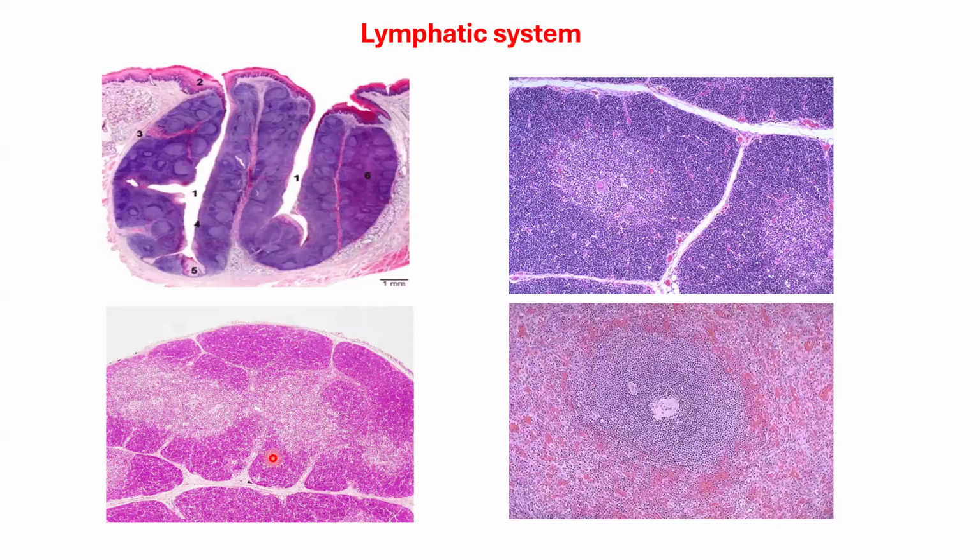What about this? For this, it's actually a higher magnification of the same. I would like us to appreciate that all of it is darkly staining. Then this is our germinal center. And then around here, we have the periarterial lymphatic sheaths. So this is also the spleen. The whole of this is showing us the white pulp, which gives a division: around here the mantle, then the germinal center, and then the periarterial lymphatic sheath, the central artery being surrounded by periarterial lymphatic sheaths.